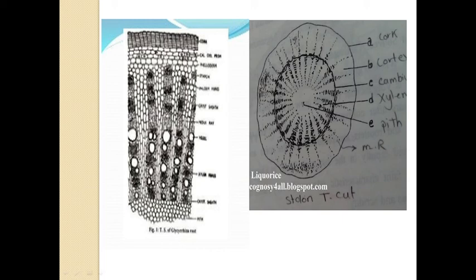Secondary tissue is divided into radial medullary rays, 3 to 4 cells wide. These are the medullary rays and these are 3 to 5 cells wide in the xylem and funnel-shaped in the phloem. In the phloem and xylem part, these are the medullary rays and these are 3 to 5 cells.